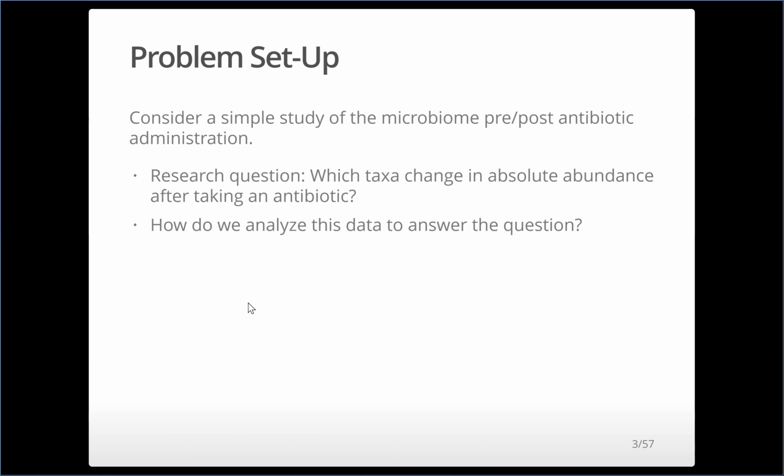All right, so those of you who've seen ALDEx2, DESeq2, all of these wonderful methods for differential abundance are probably saying, what's the point of this talk, right? I can just use those. But we're going to argue here that we can do better than those methods. We can move past some of the assumptions that they make and have more robust inference if we include the concept of scale in our models.